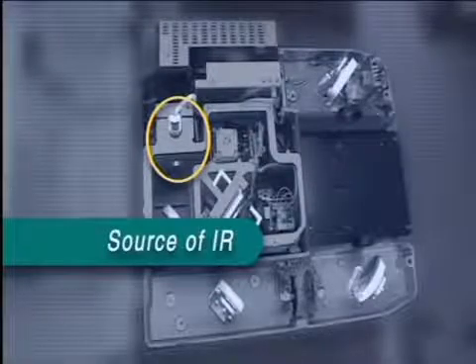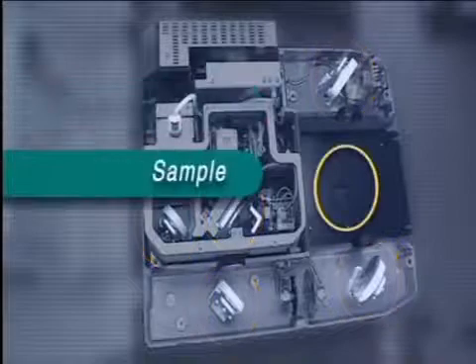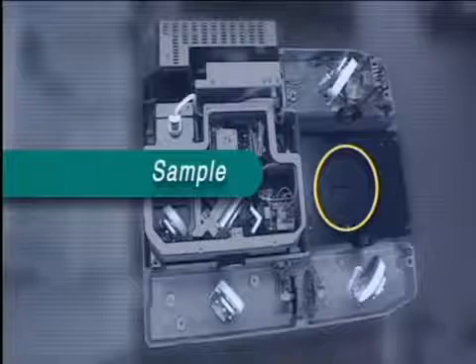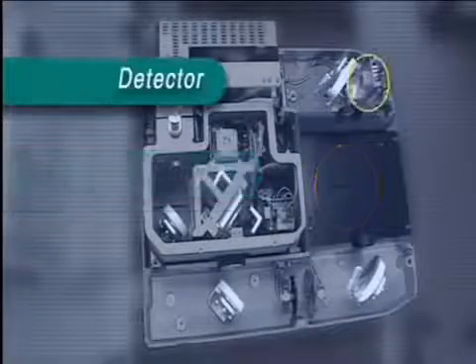The IR radiation goes via a series of mirrors into the sample, which is placed here in an appropriate holder. The radiation not absorbed by the sample arrives at a detector situated here.